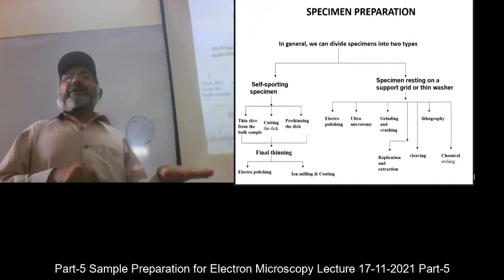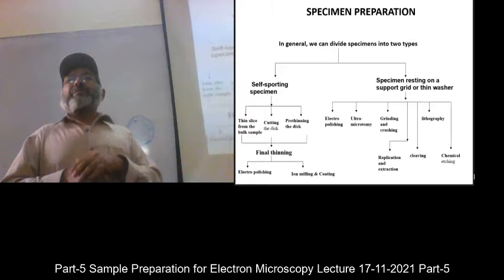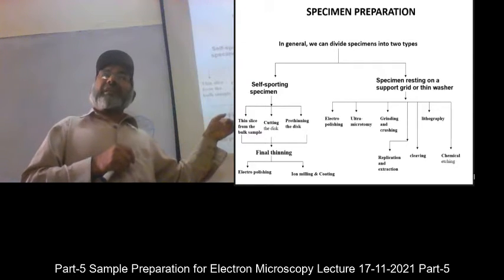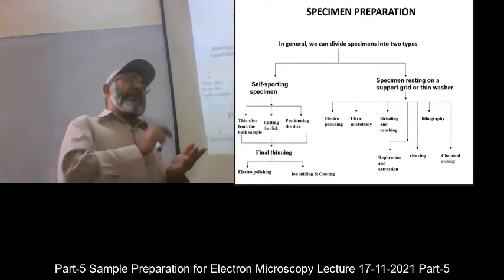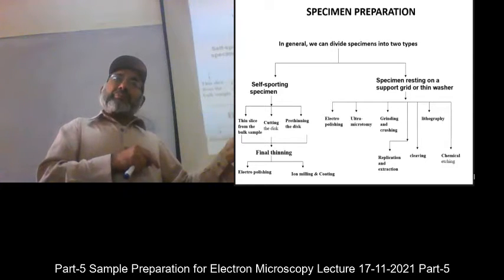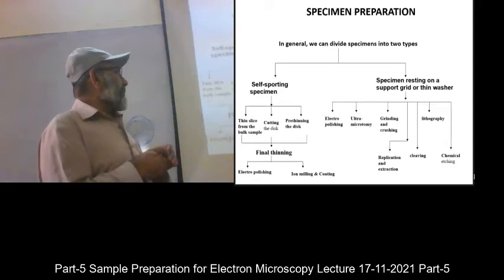It can be thinner or a little bit thicker, but if you don't follow that particular instruction, then when you do ultrasonic drilling, which is also a sensitive technique, and if instead of 100 micron you are cutting 200 micron, then you are damaging the equipment. That is why people specify that these rules, these instructions must be followed.